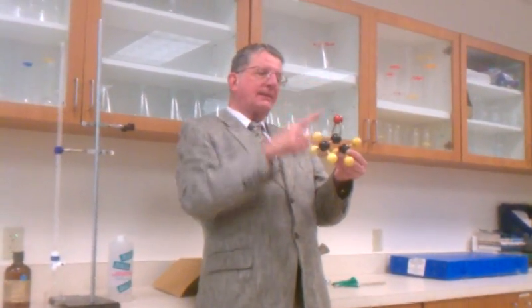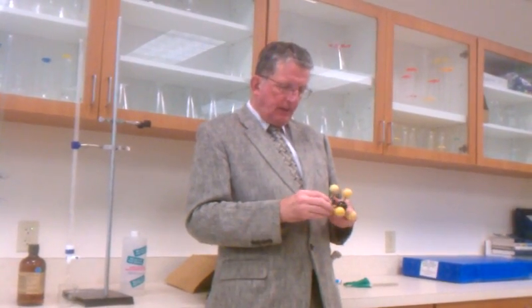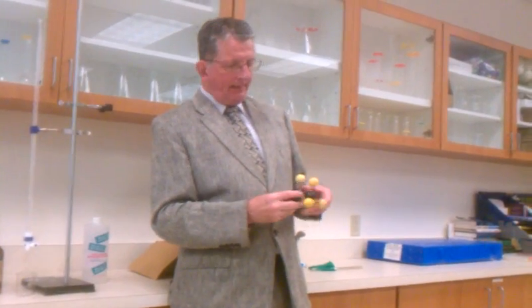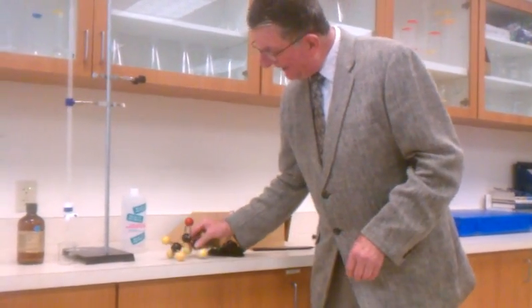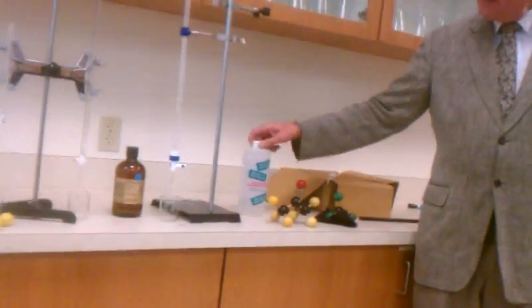And the polarity is along here. The geometry around this middle carbon is a trigonal plane because it's sp2 hybridized. And so the polarity is all right along here, and these bonds aren't very polar at all, so we can just ignore them. So what do you predict to happen if I bring the charged rod up to the stream of acetone, which is in this burette?